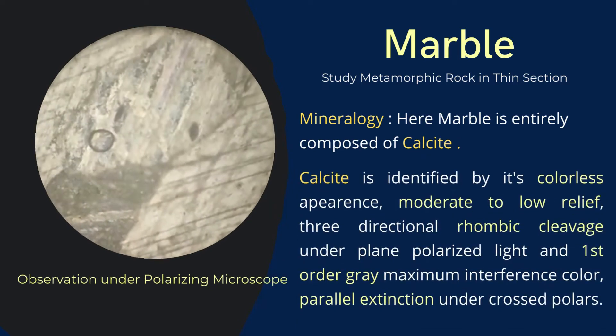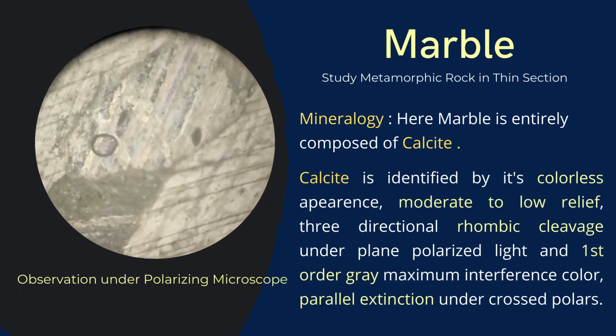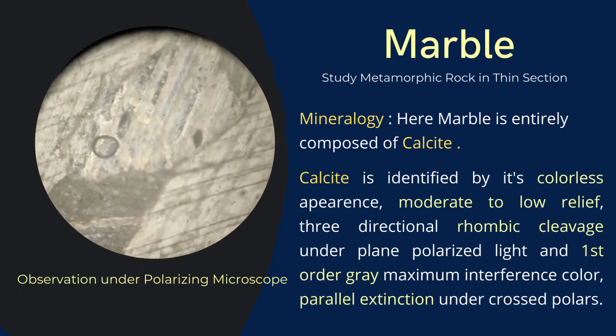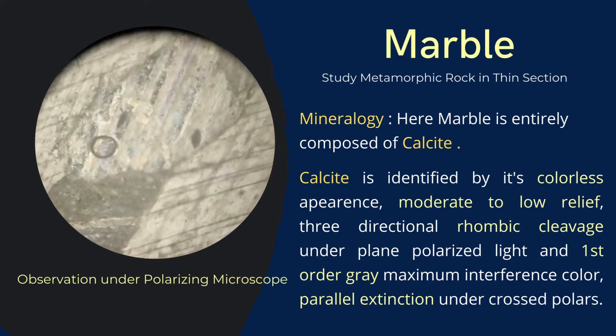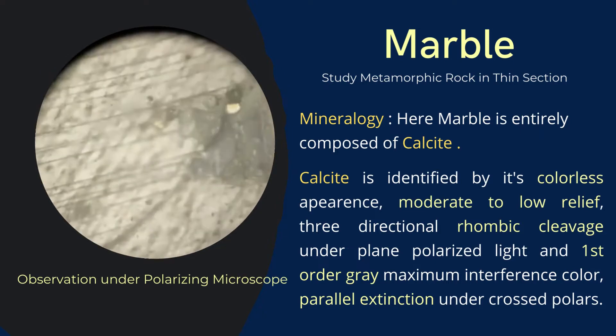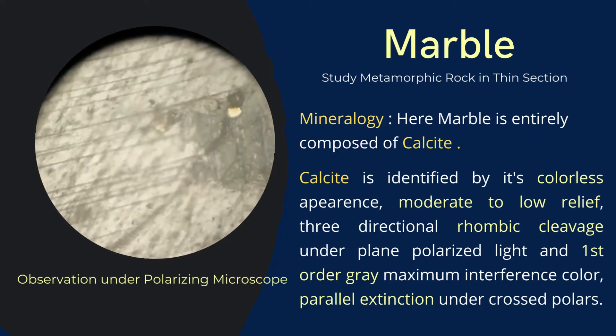Calcite is identified by its colorless appearance, moderate to low relief, and three-directional rhombic cleavage under plain polarized light.